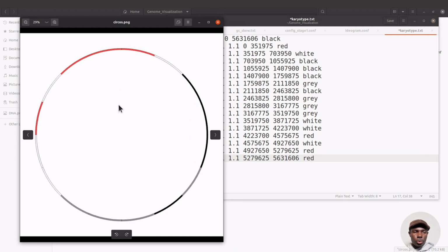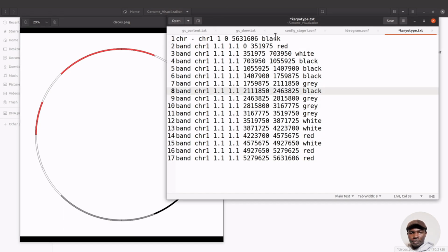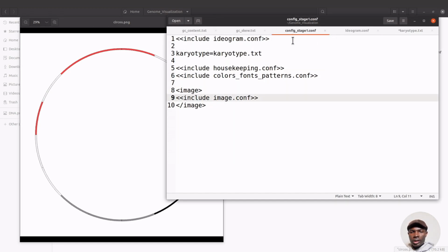So there's stage 1. We are laying the groundwork gradually. We are going to generate everything, but I thought I'd show this one first and then we can continue because it's systematic. So that's the config_stage_1. That's what we have here, and that will give us this one here.